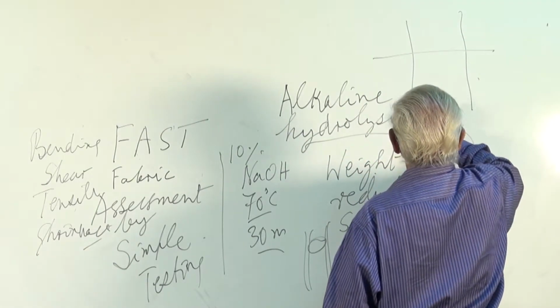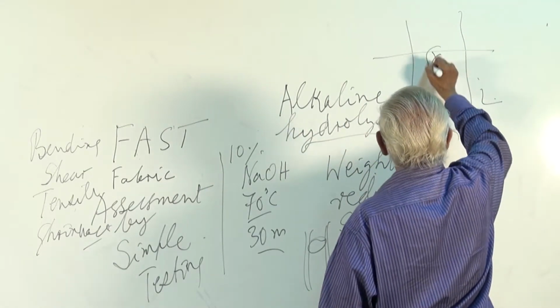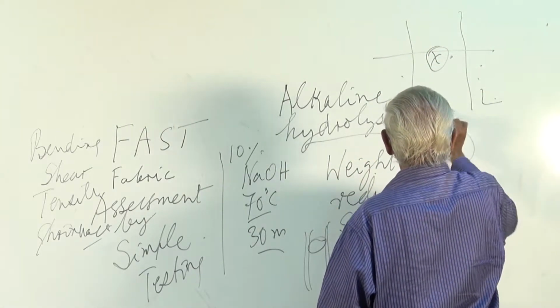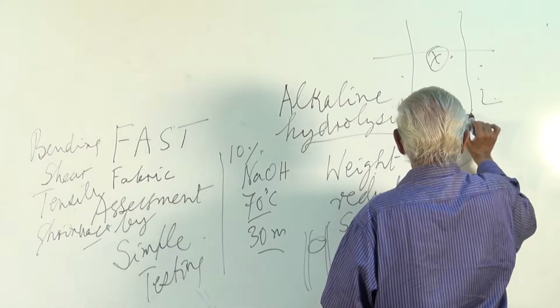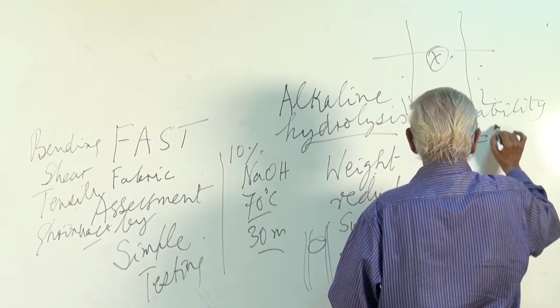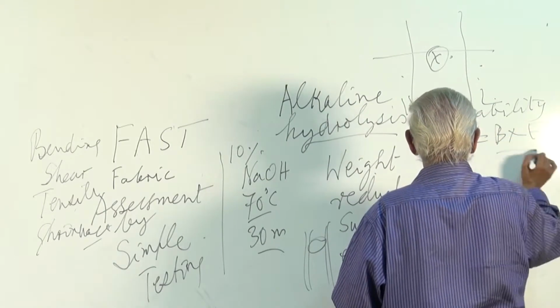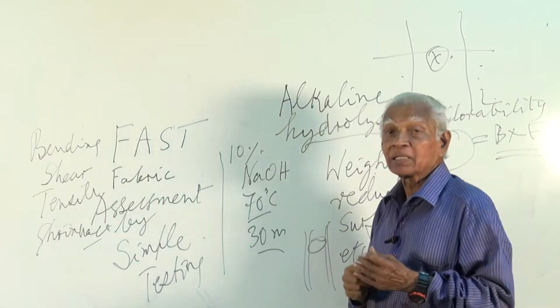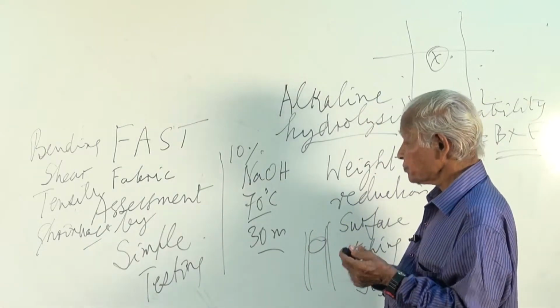This is on the high side, this is on the low side. So the fabric that is tested should remain where. And it gives an idea about the tailorability also, which is the product of bending rigidity and the extension. This information will be useful for the garment manufacturers.